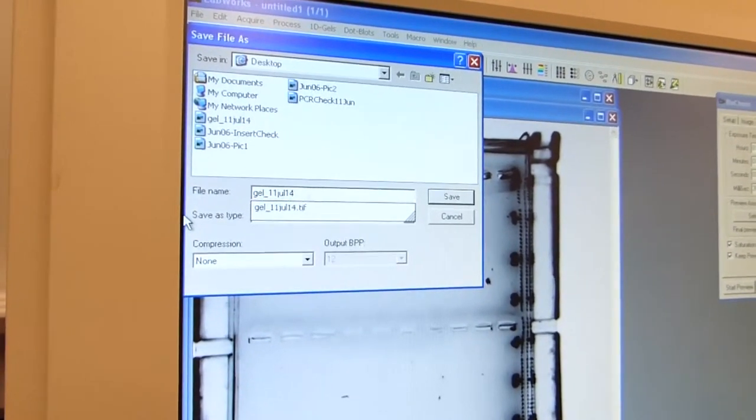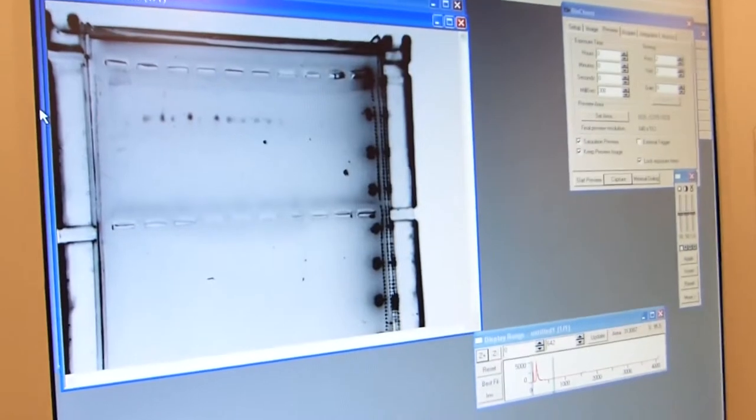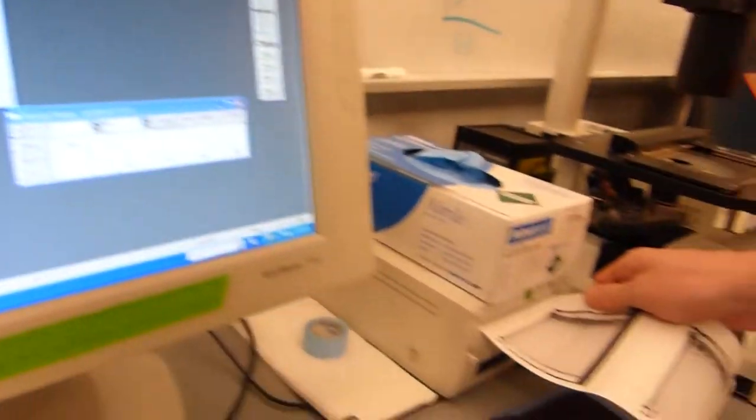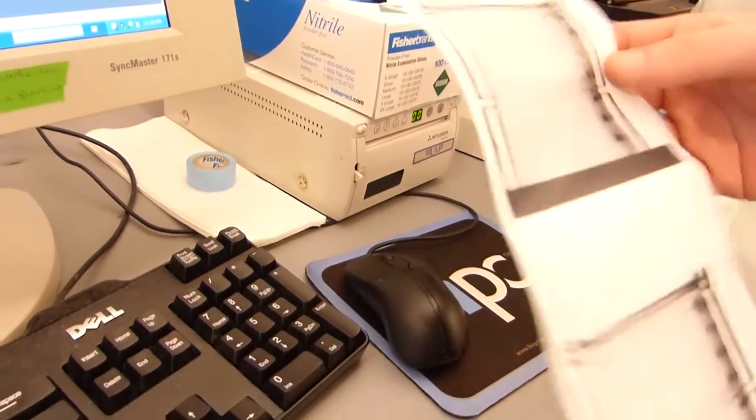You can also add what is in the gel if you know what is, if you have a specific thing that you are doing the gel for. From here we have our two printed images. We can slice it off and then cut them.